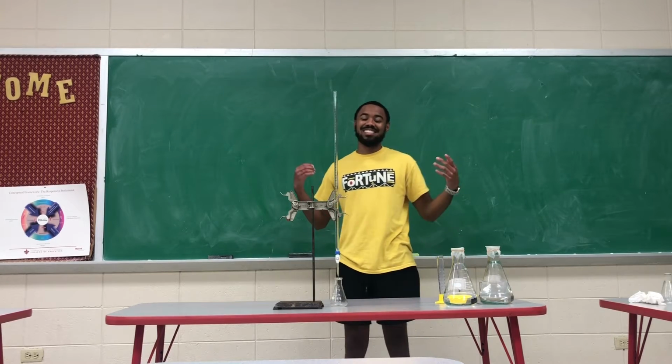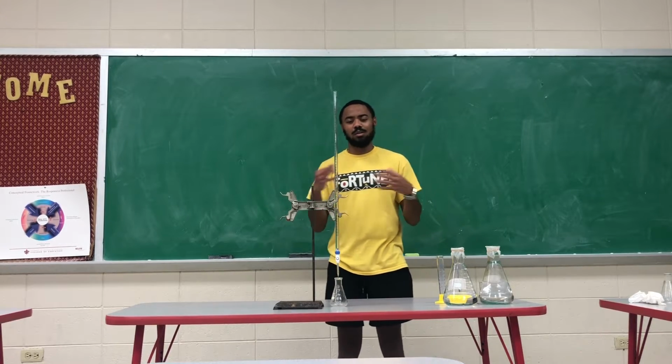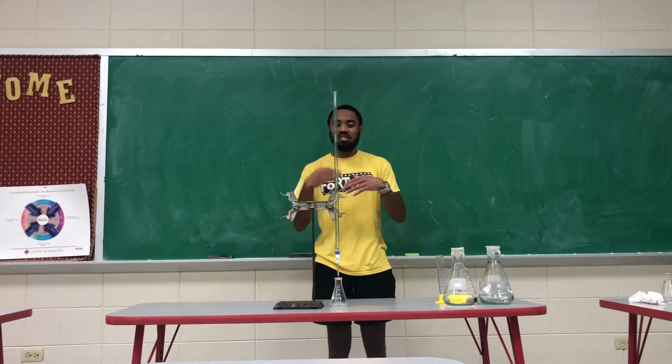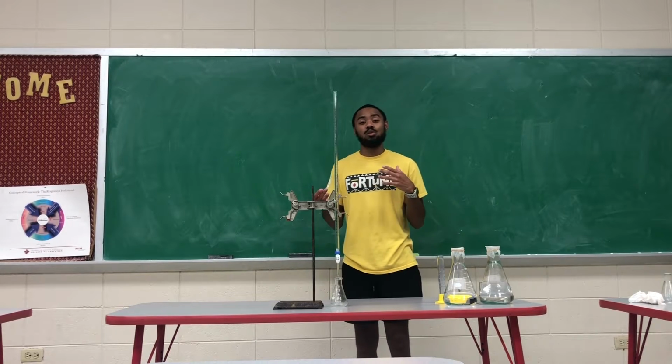Good morning, class. So today we're going to be talking about molarity, and we're going to be looking at how that happens with two different chemicals. So we're going to have one that's an acid, one that's a base, and we're going to combine those and see how that looks. So this came up good because we were working on a pH experiment, and pH has a lot to do with molarity.